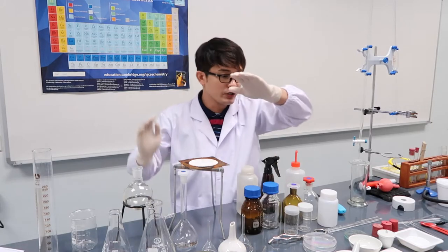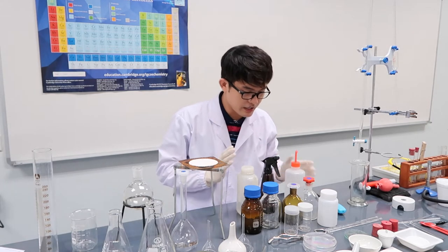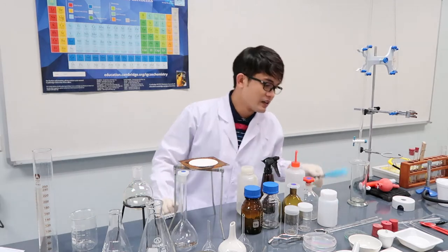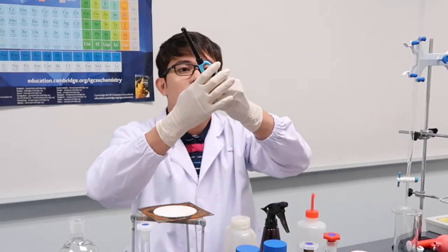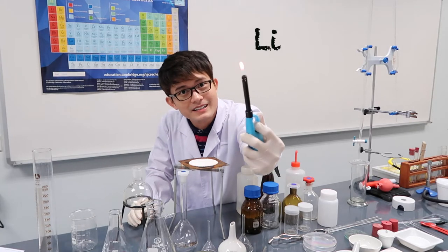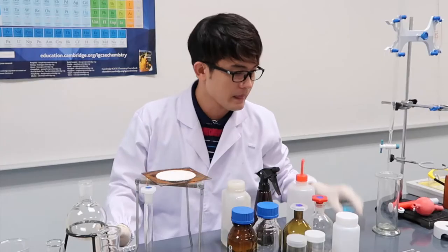We're done with the funnels, measuring glasswares, and reagent bottles, so we go to some accessories. This is a lighter to light the Bunsen burner — be careful with fire.